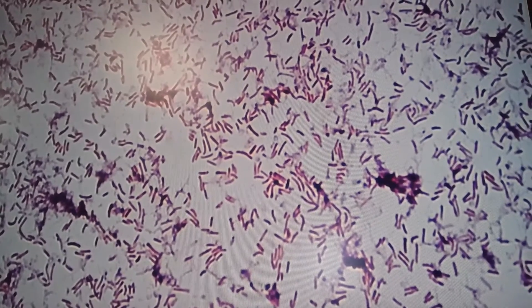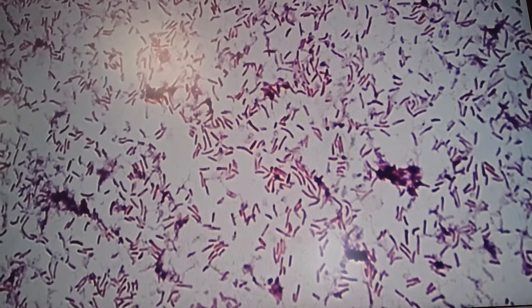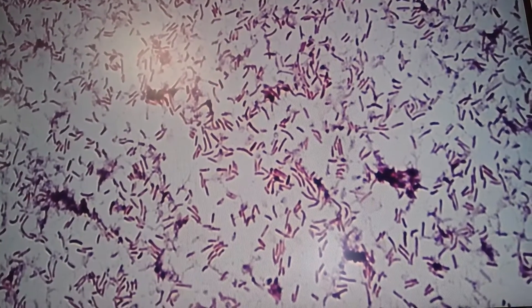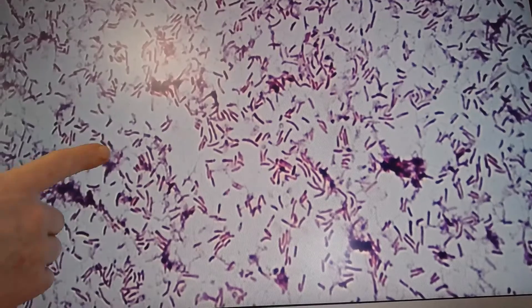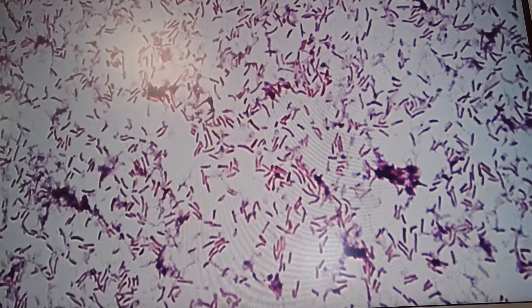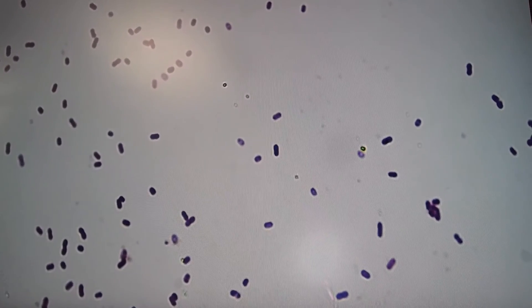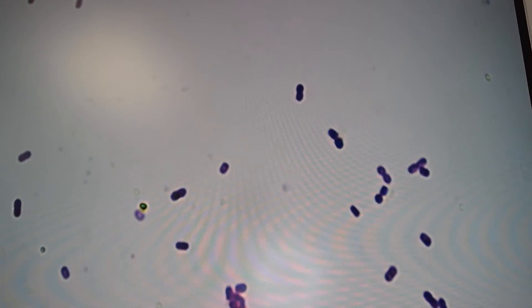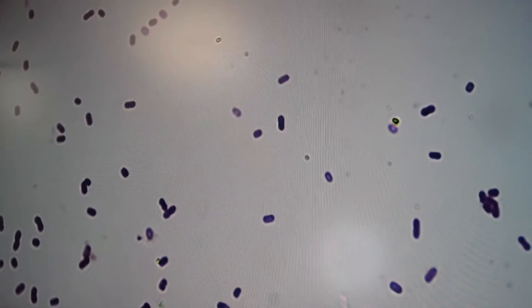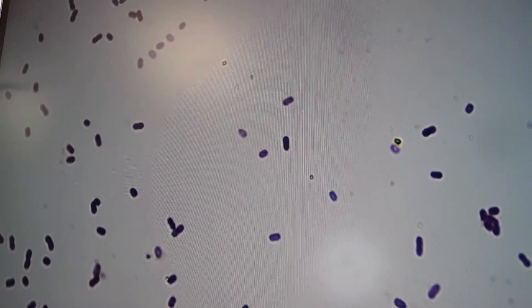This is the gram stain, where we get to see the structure of the bacteria and its proper shape. This tells us a little bit about the cell wall. These are gram-negative bacteria — each one is rod shaped, you can see them spaced quite randomly, and each one is relatively regular with this rod shape. The next slide is a gram-positive, and the shape is what we call cocci — they are much smaller circles, and these ones are arranged in pairs. You can see in some of them there's a little dip in the middle, or you can see it's actually two individual cells that stay joined — that's their arrangement, they stay in pairs.